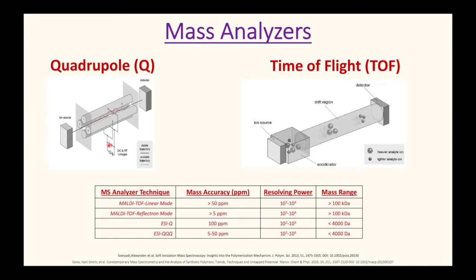So in reference to the time of flight mass analyzer, TOF is classified as a non-scanning mass analyzer that will emit ions from the ionization source. The ions are accelerated through a tube. The velocity of the ions is converted to a mass-to-charge ratio or value. The TOF analyzer is great for acquiring full mass spectra and is also an excellent choice for quantitative and qualitative studies. In this table, the capabilities between the two mass analyzers are compared.